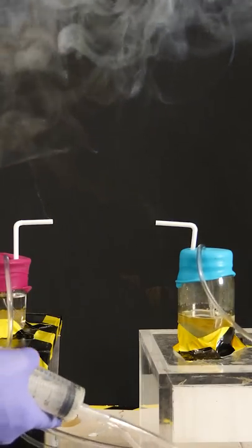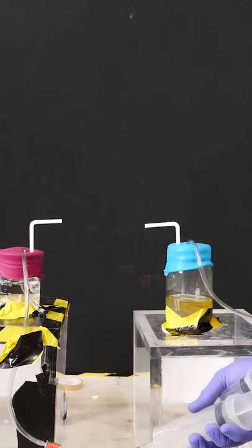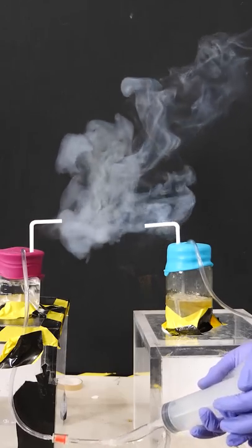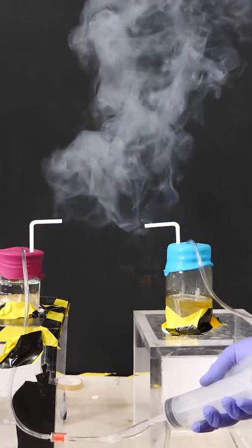When they combine, they make ammonium chloride, and these are small little crystals. So the white smoke is actually small crystals of ammonium chloride.